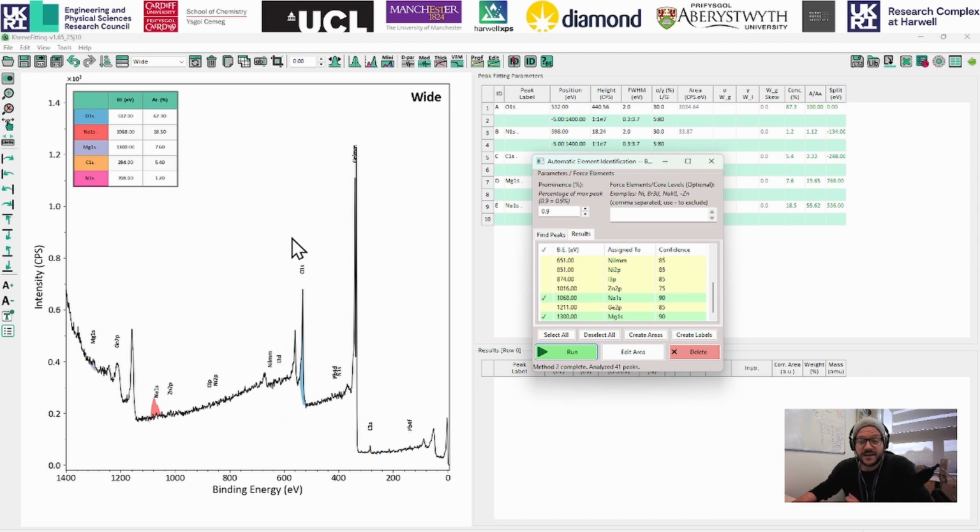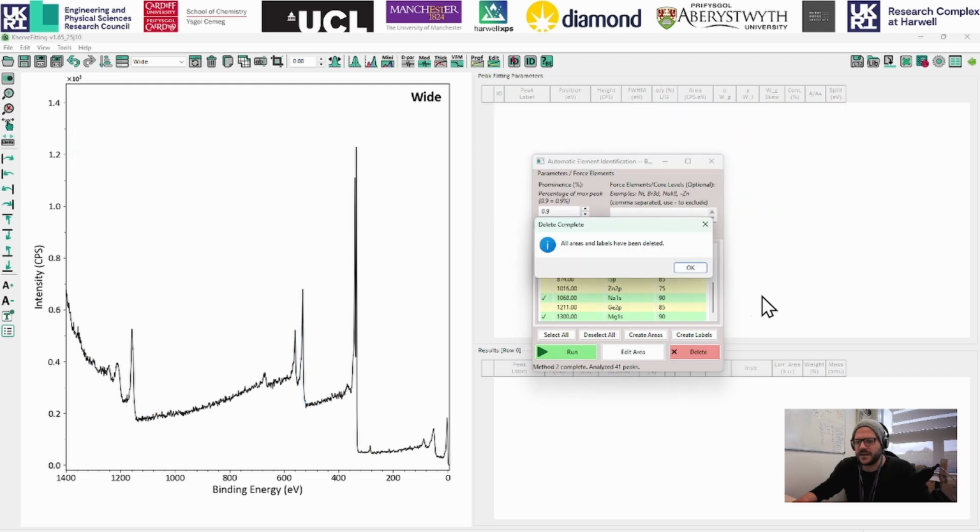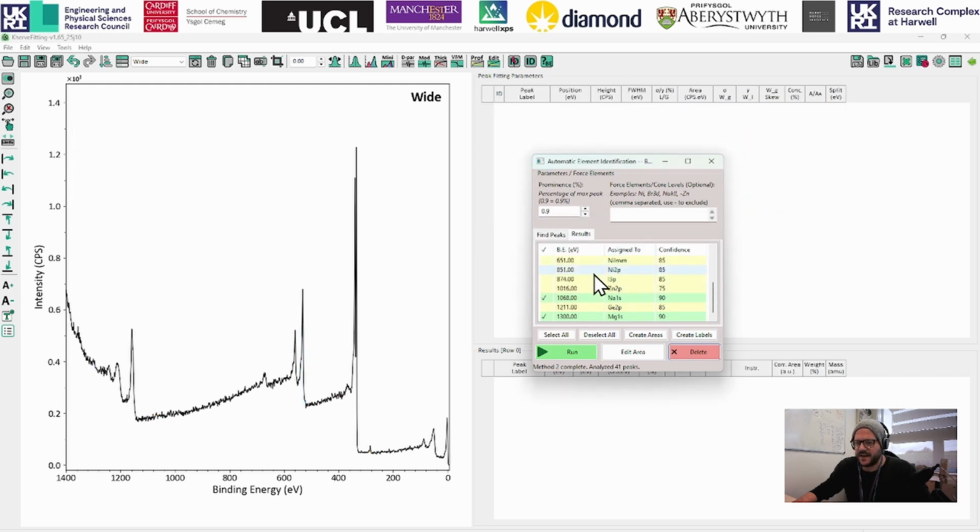And if we come over here, it's decided that yes, we've got some oxygen 1s in there. Actually, this is going to be the palladium 3p peak rather than the oxygen 1s. So just by itself, it's probably not done an amazing job. So we can just delete everything that we've put in, start again.